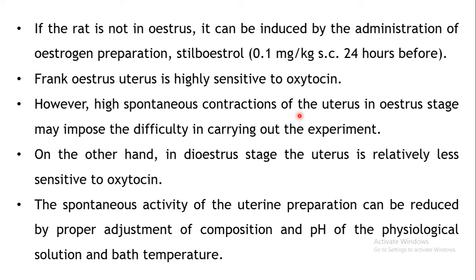Without adding oxytocin, the uterus can still contract spontaneously. This can be overcome by adjustments in the composition of the physiological salt solution, or the pH and bath temperature. All these experimental conditions can be adjusted to reduce the spontaneous contractions of the uterus. Also, you should ensure the rat is in the frank estrus stage, as the diestrus stage of the uterus is relatively less sensitive to oxytocin.